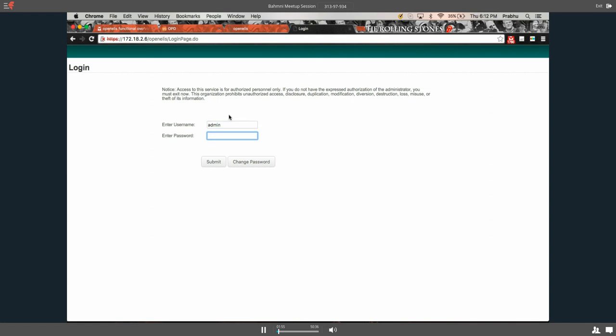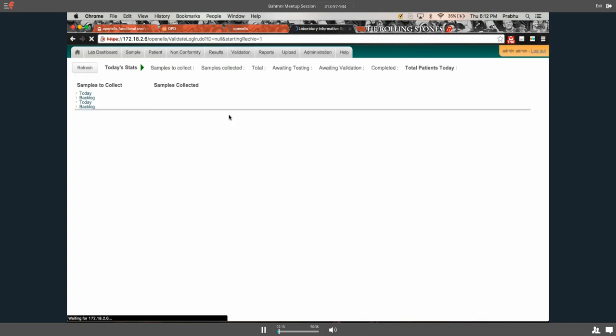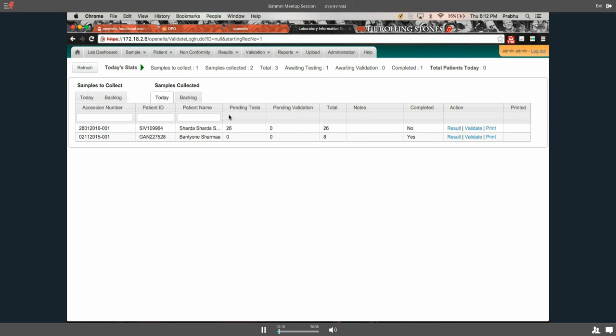We have a user called admin. Right, so we are logged in.